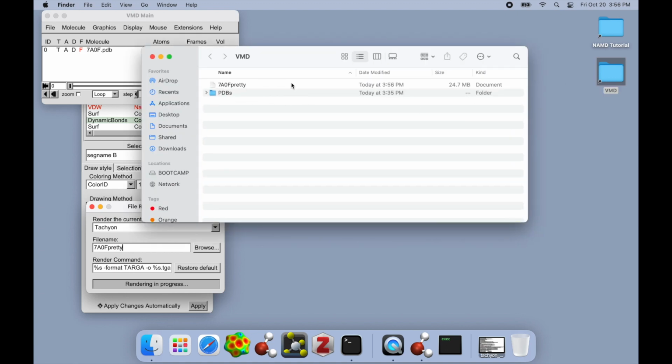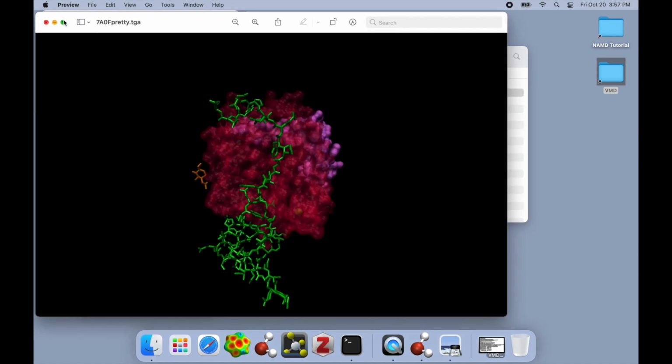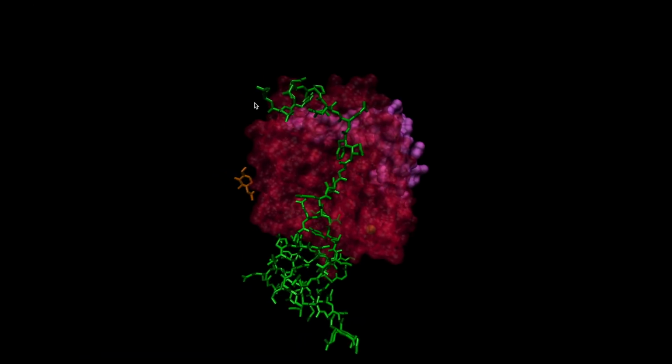It's going to show up in here because this is what I set as my home directory at the beginning of this video. So we're just going to have to wait a minute for it to actually show up. But there it is. If we open this up, now we can see it has a pretty cool look now that it's all rendered up. We can see the translucent stuff. We can just see the sodium in there. And we get a really good idea of the actual structure of this protein and what it looks like functionally.